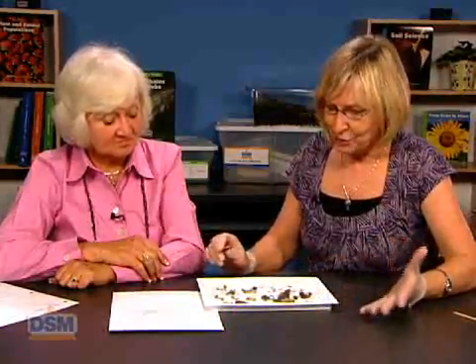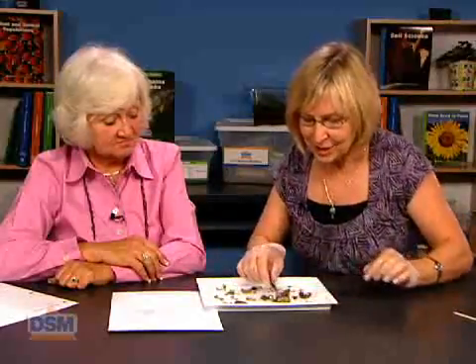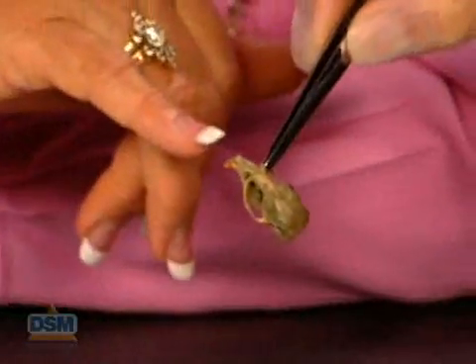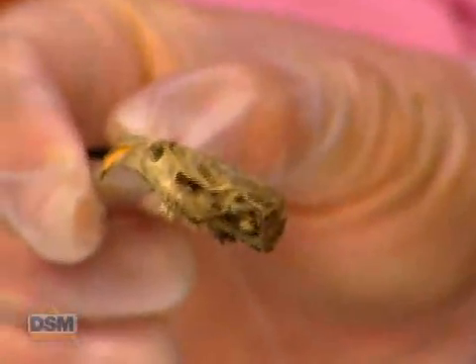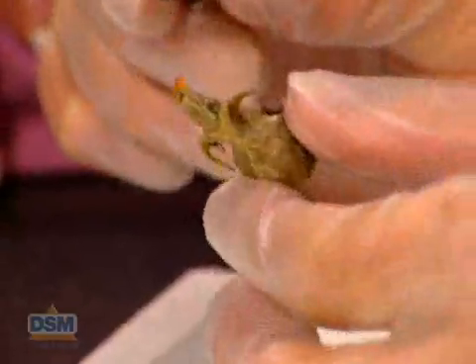Let's get back to looking at what we found in our owl pellet, Johanna. We've got a lot of bones that we've cleared out here, and we have our bone identification sheet. So let's see if we can recognize any of these bones. Let's take a look at this first one. What do you think this is? Okay, students will probably, when they begin dissecting, think that this is a bird skull. How could we let them know that it's not a bird skull? What are some things, Kathy, that you think will deter their thoughts of a bird skull?